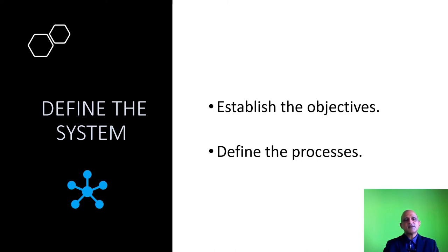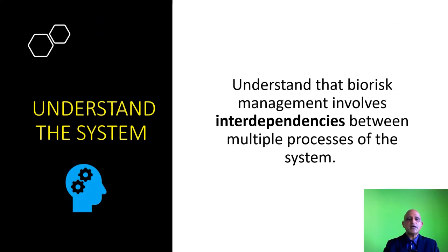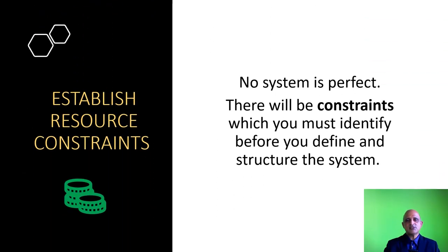Let us go into the system itself. The first aspect is defining the system, which involves establishing the objectives and defining the processes. The second aspect involves structuring the system — organizing it so as to achieve the objective in the most efficient manner. Understanding the system involves interdependencies between multiple processes, and this is where your role as a Biorisk Manager is critical. You need to observe situations as they occur, document these processes, and then apply corrective action. This is where you have continual improvement — what we call CQI, continuous quality improvement. Resource constraints must also be established and discussed with your top management.